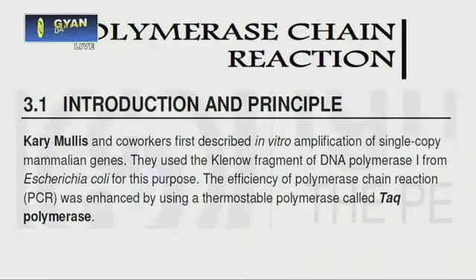Now we come to the next experiment, that is your experiment number 3, that is polymerase chain reaction. In short, it is called PCR. Perhaps by this time, the students who have started your courses, either in the first year or in the second year, should be familiar with what is meant by PCR, polymerase chain reaction. What is the purpose of doing PCR?